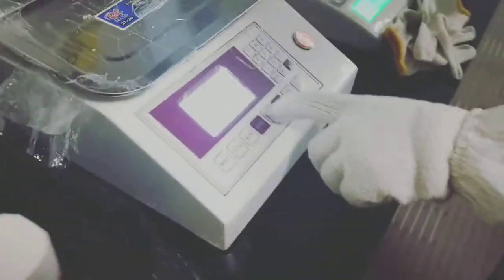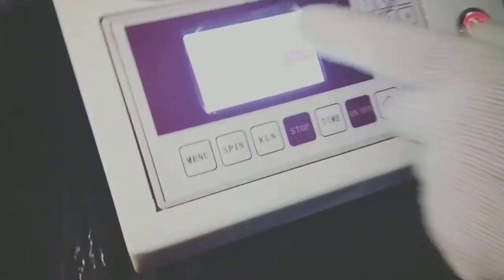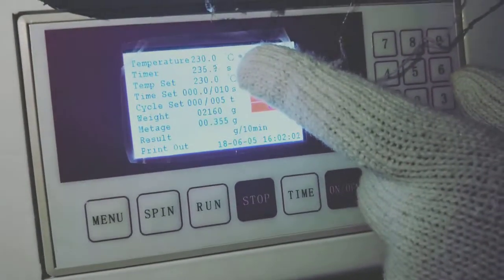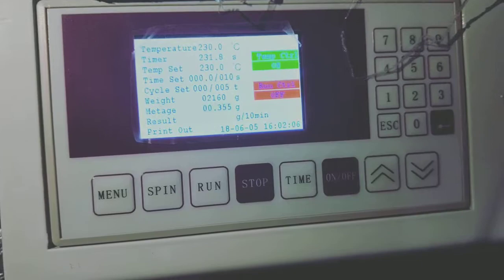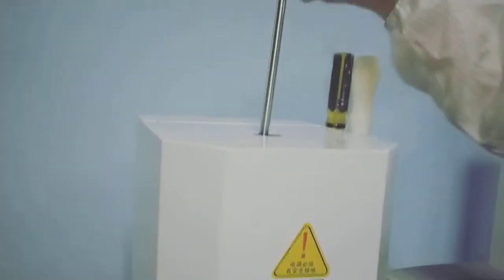Press time key. It will automatically calculate 4 minutes, 240 seconds. Then we just wait and then add the sample.